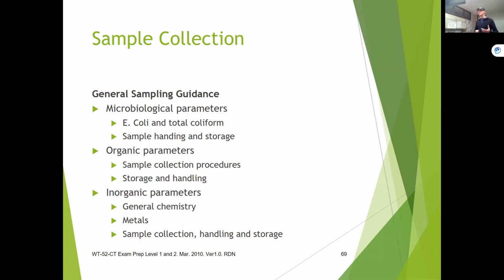Making sure that if there are any special preservatives that have to be put in, you're following the directions that the lab gives you, so that these samples are going to be the best samples that you could possibly get. Handling and storage are super, super important.